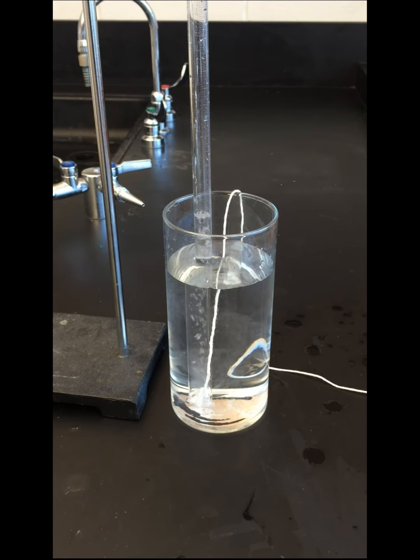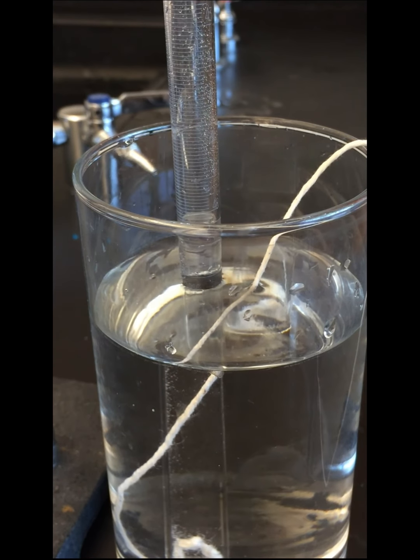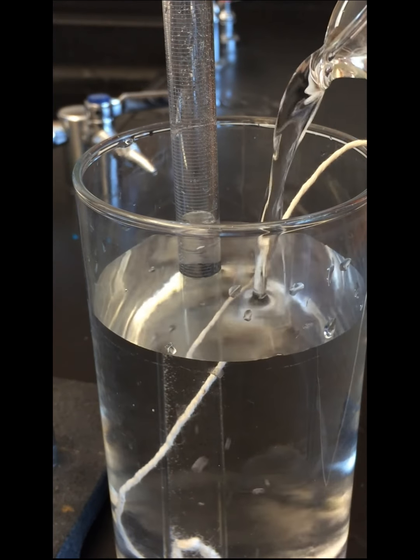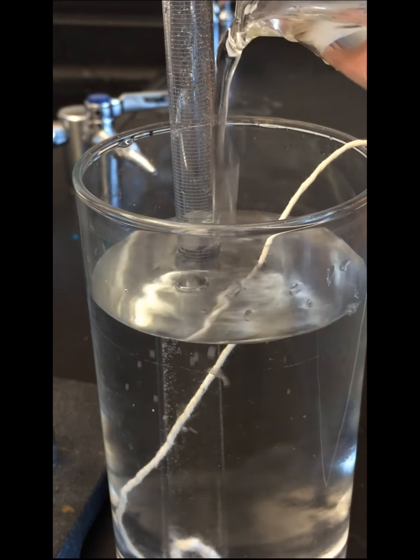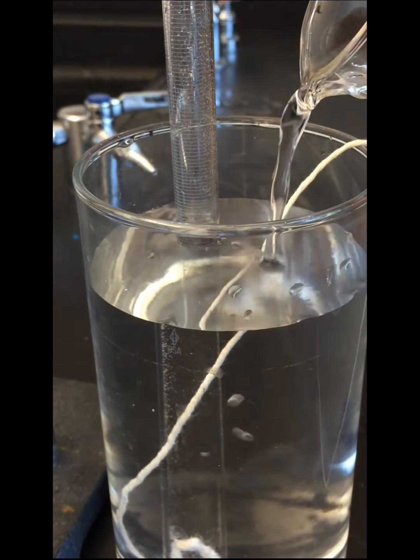At this point, the water level inside the eudiometer and the water level in the beaker will need to be adjusted in order to make sure that they are the same, both inside and out. This may involve raising the eudiometer up, or it may involve adding more water to the beaker.